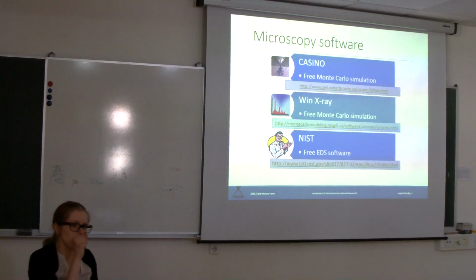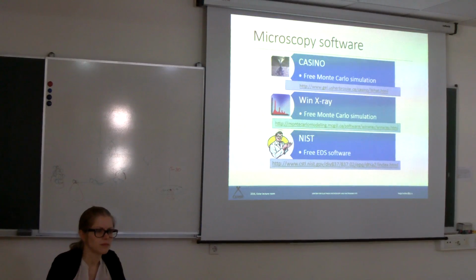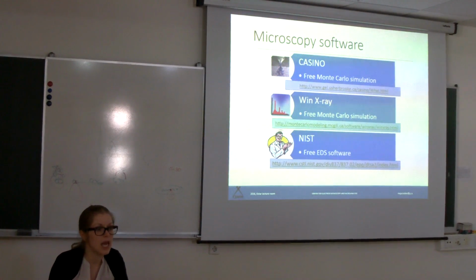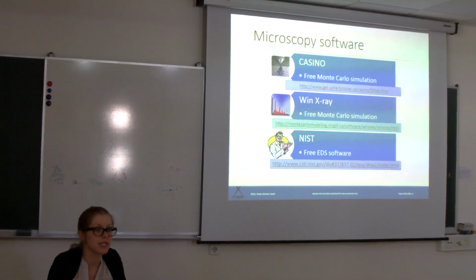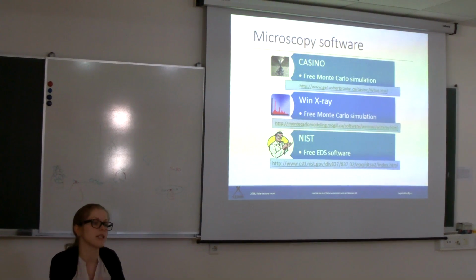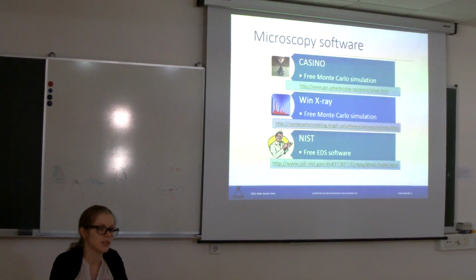Can I ask one more? In which conditions is it necessary to do the standard EDS analysis? What are the standard conditions? Yeah. The standard conditions on the old microscopes are 20 keV, if you don't have your own samples. On the new microscope, in Inca, if you see the denotation standard 1999, it means it's a virtual standard, not a pre-recorded standard. You can use any proper parameters because it's based on simulation. On the old ones, they were collecting standards. But we will cover that in the next workshop.